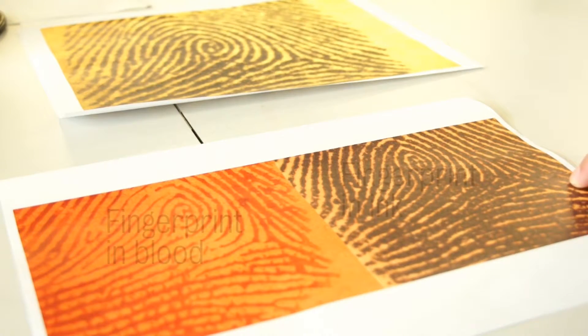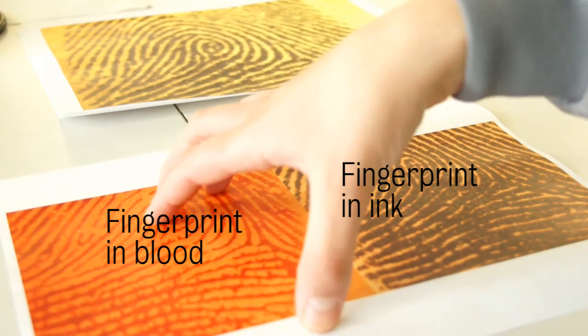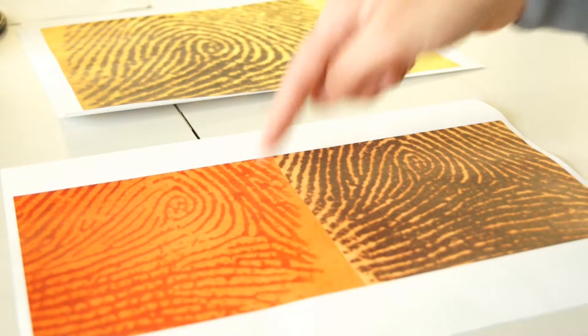What I'm trying to do is figure out if a finger mark in blood has the same level of detail as a reference print. This is a bloody mark and this is a reference print. What I'm trying to do is compare the two — the reference mark and the bloody mark — and see how much of the detail that I have in the reference mark I can get in this mark.